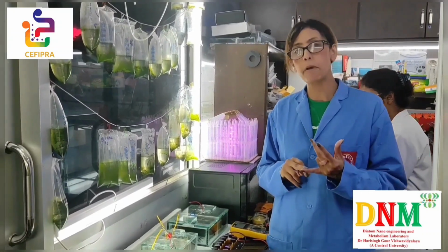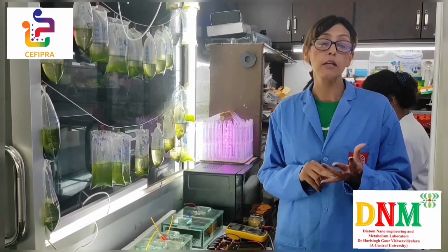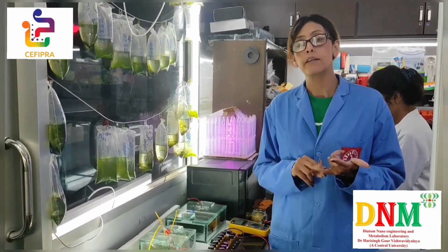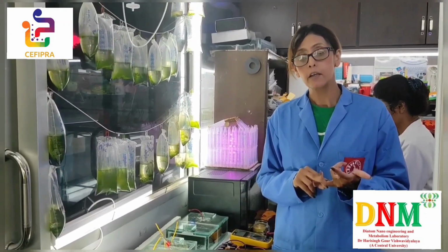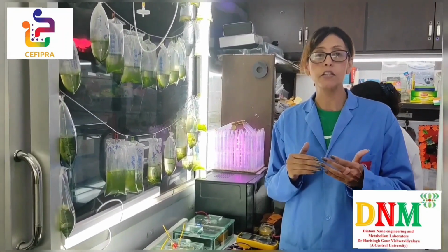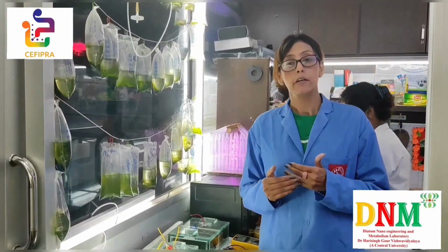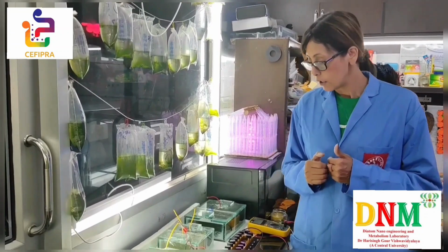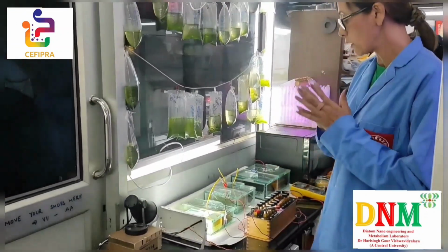Like we used the PEF, we used centrifugation, we used the resonance energy, the lab on chip device which we made at IIT Bombay, Nanofabrication Center, INUP, as well as NCPRE. So we found that resonance energy was good enough for harvesting the biofuels from the diatom. In the case of Haematococcus, now we are using the high pressure device for harvesting the astaxanthin. That work is in progress. So this is an economical way.